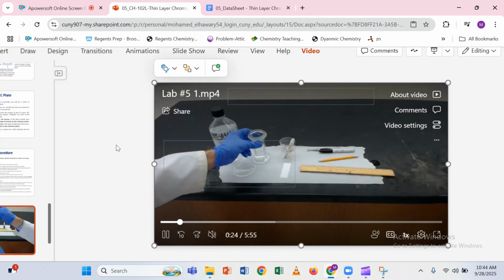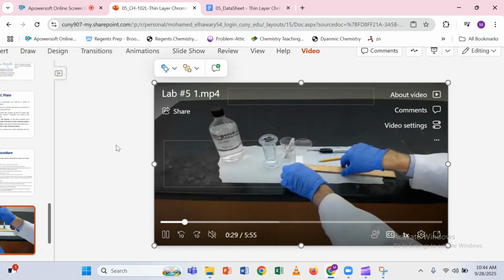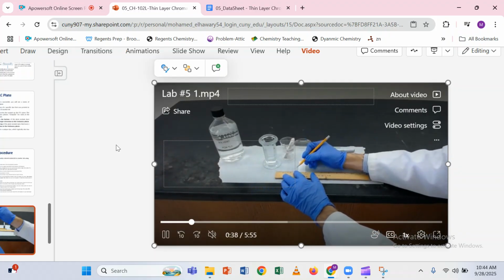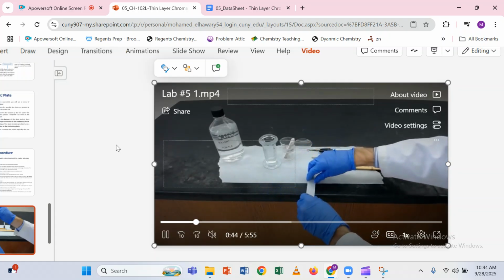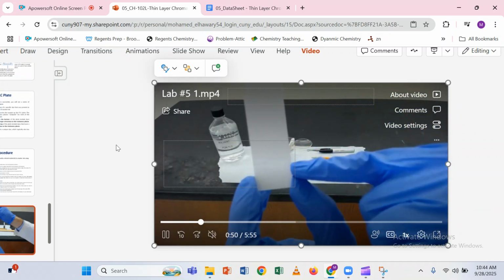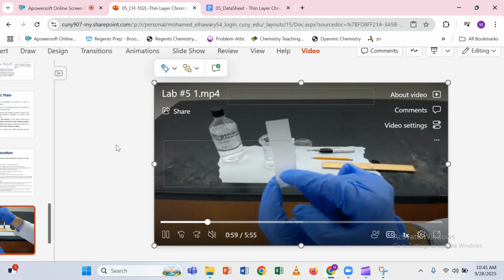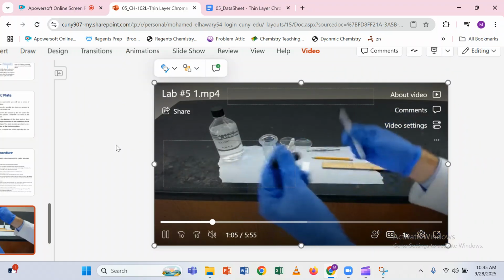We have to add the solvent first. As you can see, we're not going to cover the entire chamber. All right, now we're going to take our TLC plate, and from the bottom, we're going to take a ruler and a pencil, and we are going to make a line, and this will be our starting position. We want to know where we are starting, because when you take organic chemistry lab, you're going to calculate something called the RF value, which is the initial distance and final distance, relatively speaking, that these dots travel.